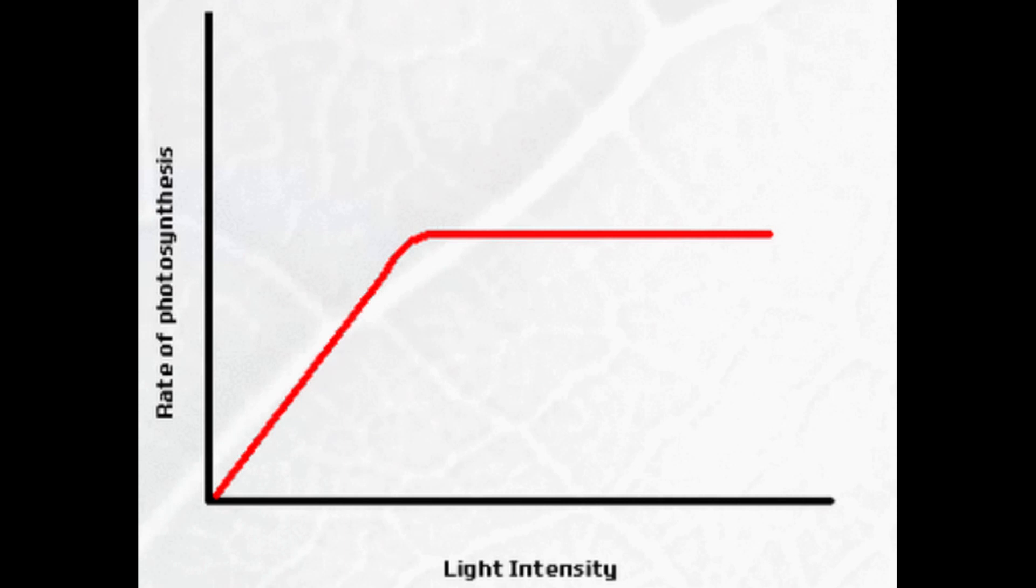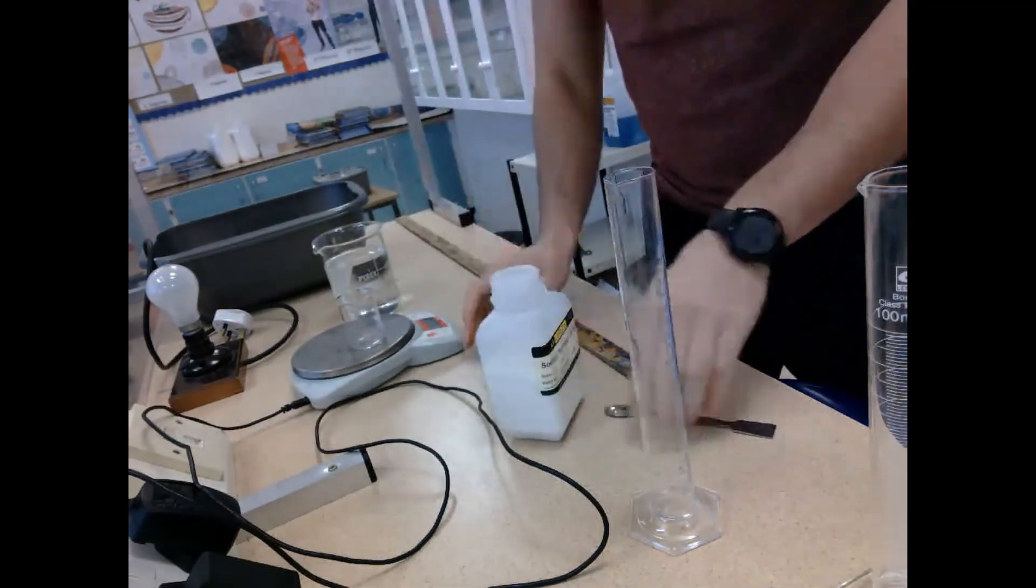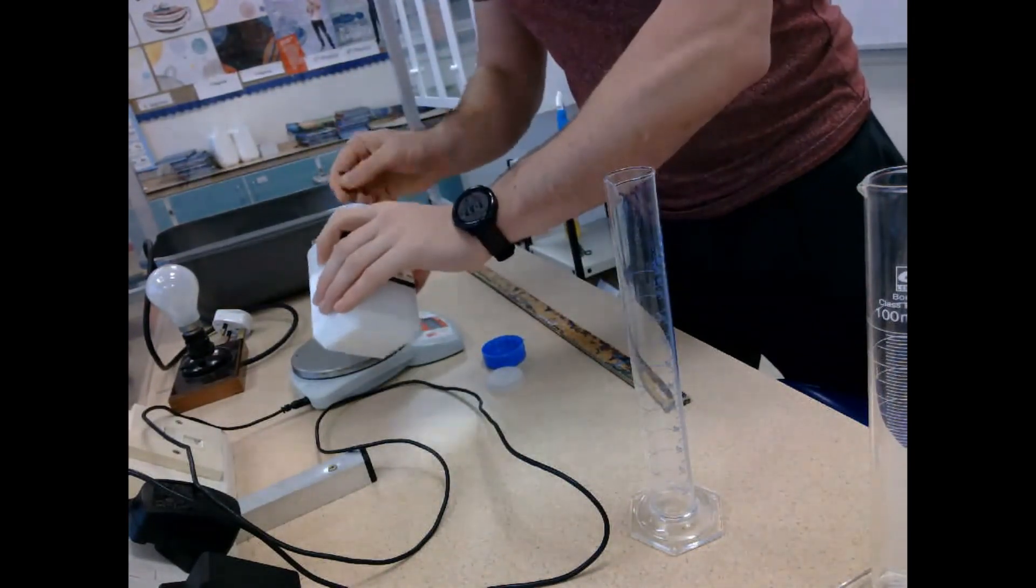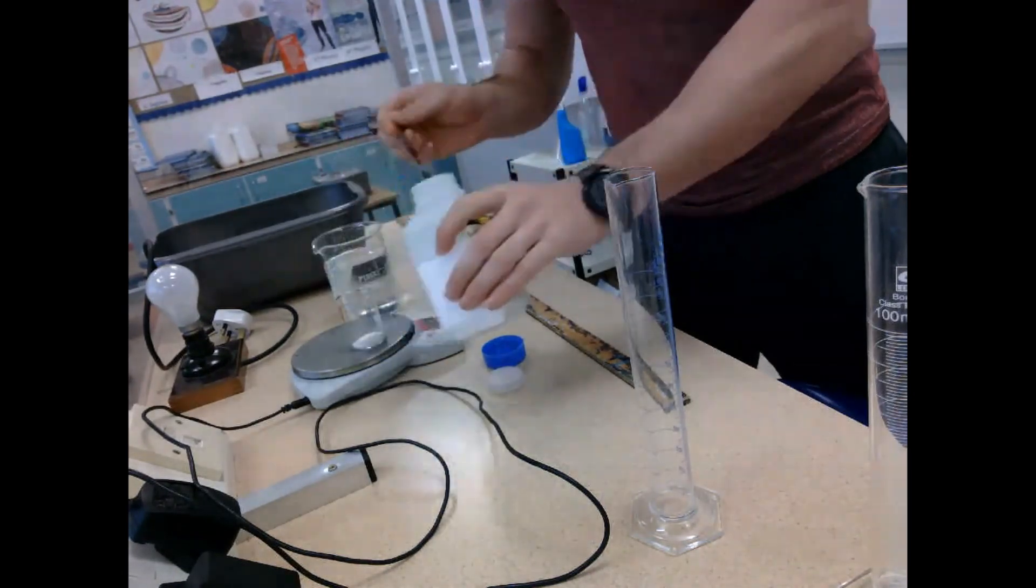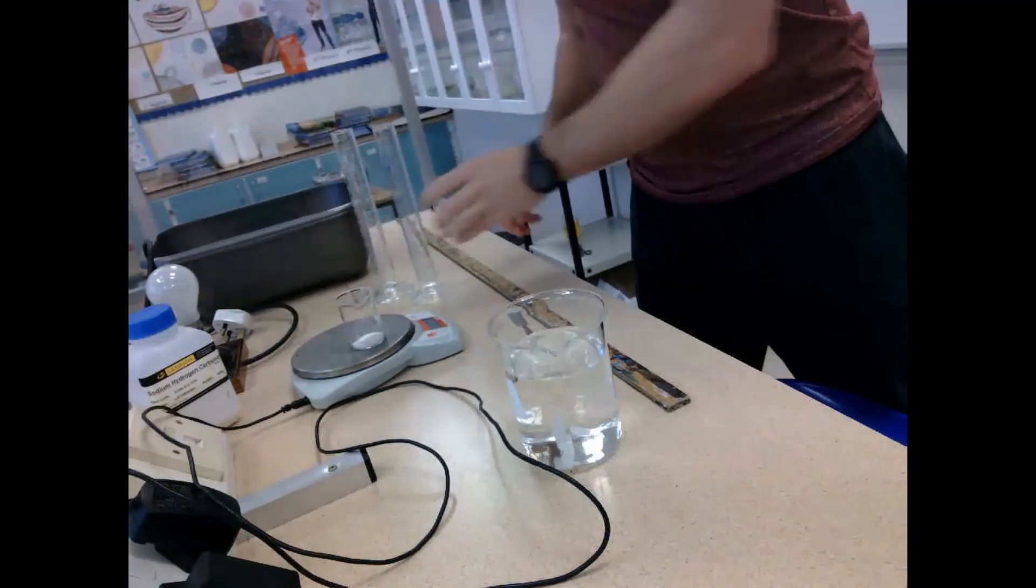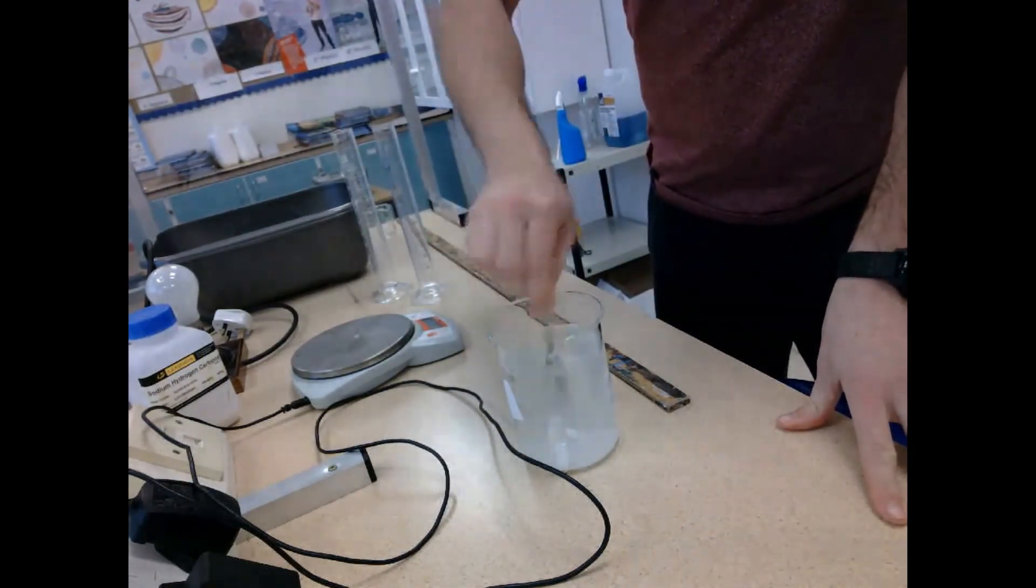So the first thing we have to do here is make sure we have our control in place, and we do this by measuring out sodium hydrogen carbonate. We're going to get five grams of sodium hydrogen carbonate and place this into 500 milliliters of water, stir that up, and what this does is it keeps the level of carbon dioxide steady throughout the entire experiment.